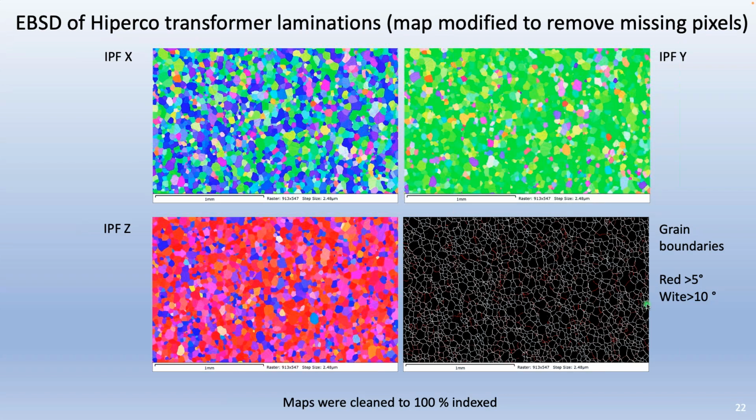So if you want to include binning of the data, the resolution of your actual image when you take it, all that sort of thing is probably important and useful to doing the experiment and also presenting your results. So the more data you have that you can talk about, I think the better in a publication. And it also helps the next person coming along to try and do the same work. They're going to say, oh, they used additional binning to achieve the speed and the map result. So maybe I should try that. Okay.